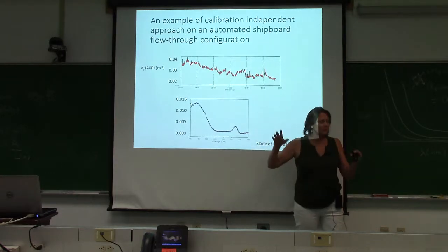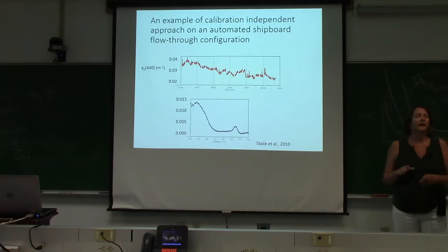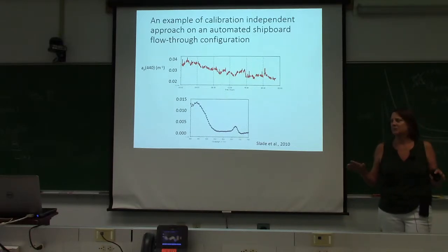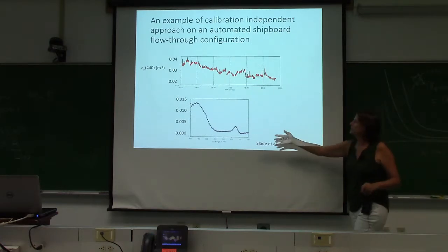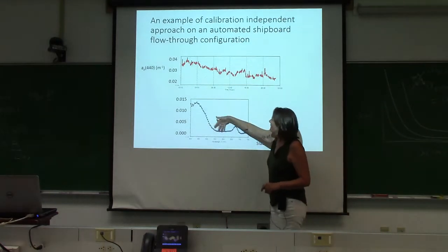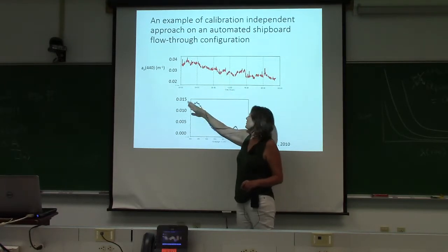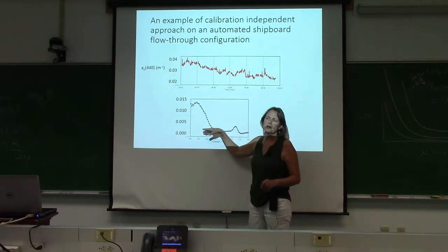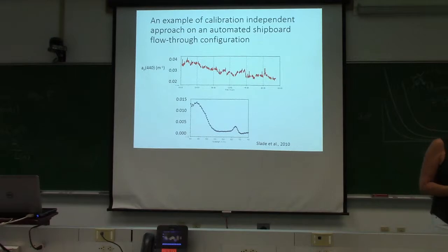So doing the total water sample and then the filtered water sample is your best friend, because you can have all of the errors in the world in your pure water cal, but when you do this, it all goes away and you can derive beautiful spectra. So you're getting one of these spectra every point along here. And then you can begin to resolve features and slopes and non-algal particles, different pigments, phytoplankton functional types for Ivana. So it's incredibly powerful.